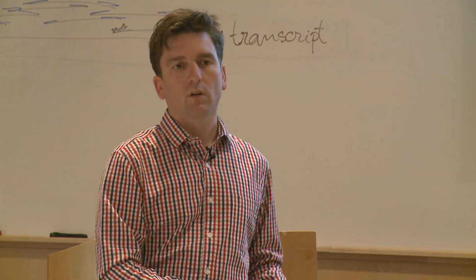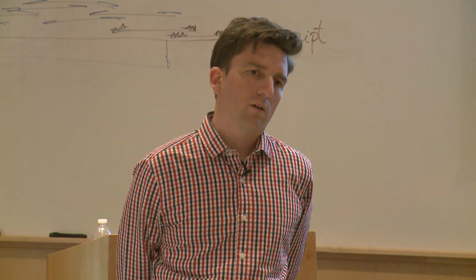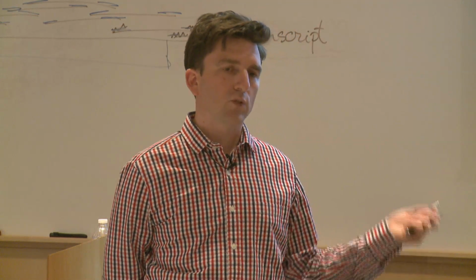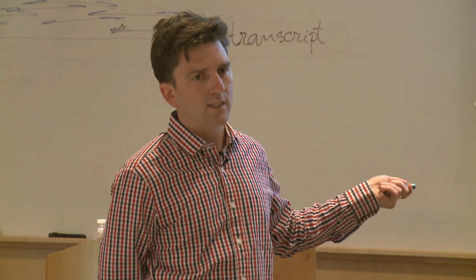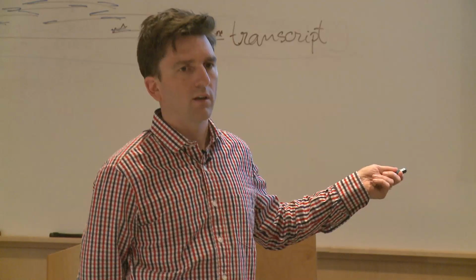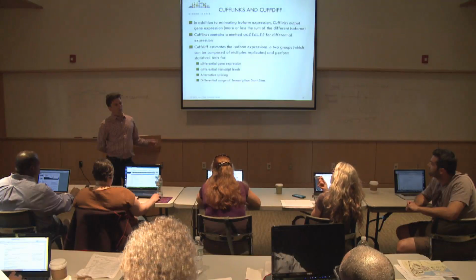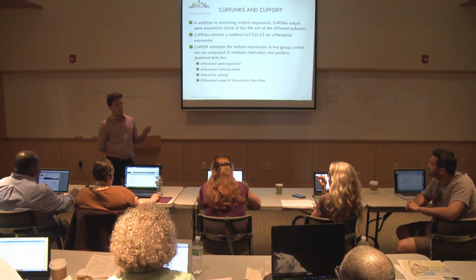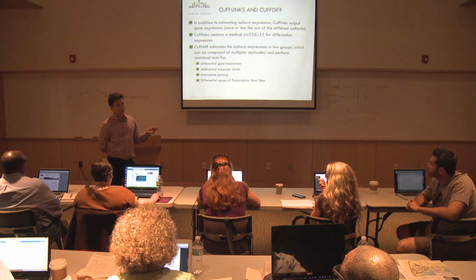Again, I'm probably jumping ahead because it seems next week is more focused on the development of pedagogy and curriculum. Yeah, so next week, and mostly Molly will describe the statistical analysis that is taken care of here, okay? So you're saying that it would be good for genes, but not necessarily, if you really want a good idea of how much isoforms differ, this probably CUFFDIFF unless you have like perfect.